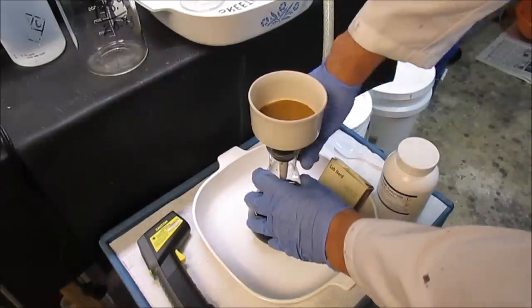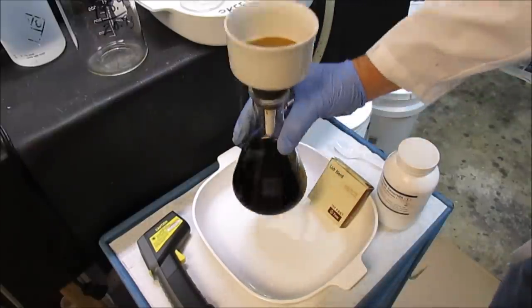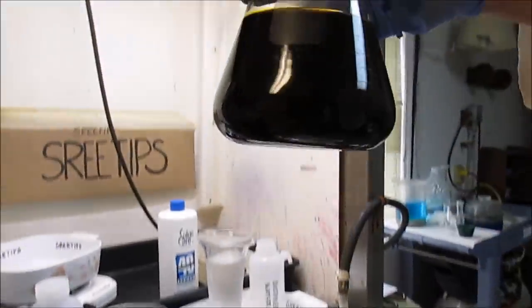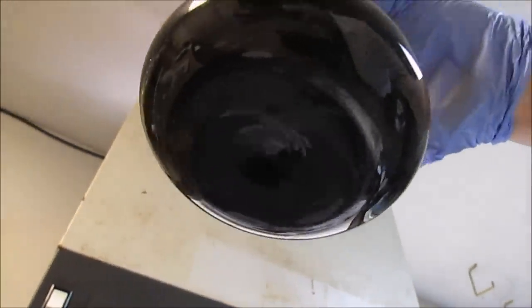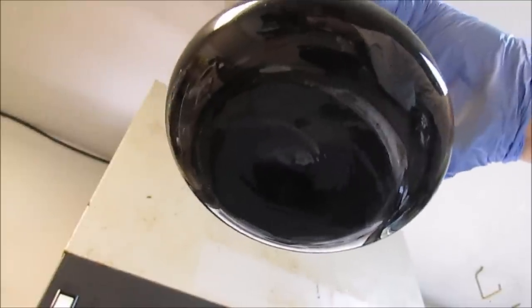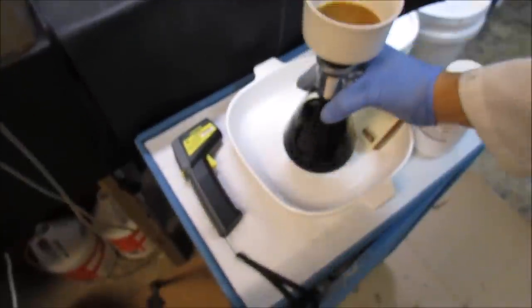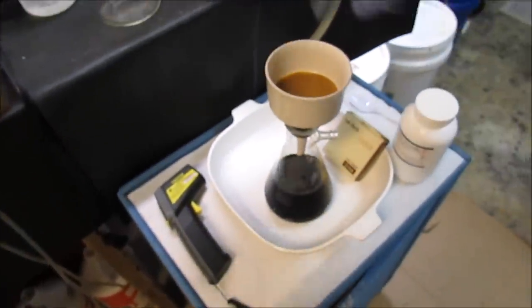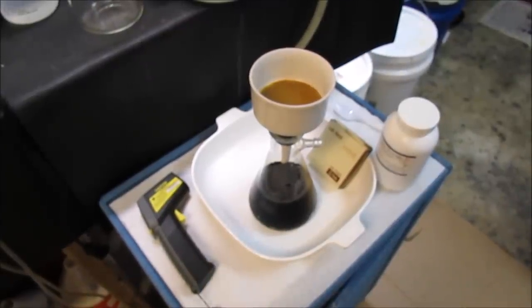I'm just going to take a look at the bottom of this flask to make sure there isn't a bunch of junk in the bottom of the filter. I don't see a bunch of stuff in there, so I think we're going to be okay with this. I'm not going to rinse down the filter — I'm just going to leave that like it is. I don't know if adding some hydrochloric acid or even water might dissolve it and pass through the filter and contaminate my solution down here. So I'm just going to leave it like it is.